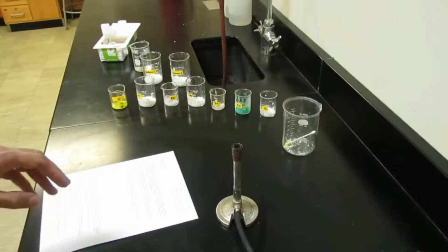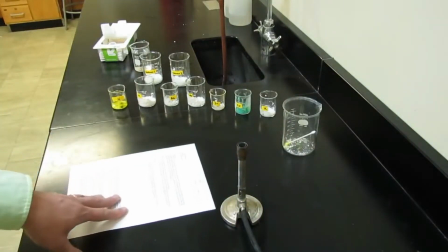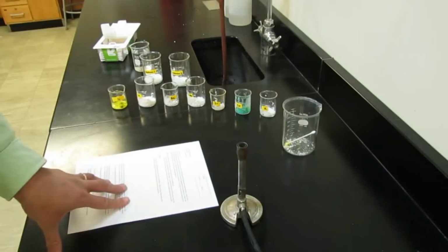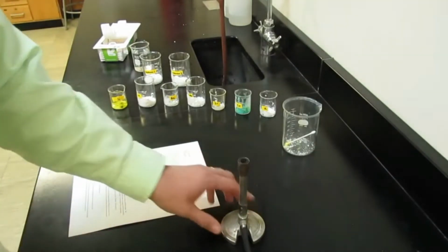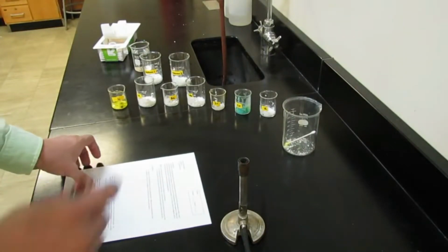Okay, welcome to our flame test lab. I'm going to show you folks how to light a Bunsen burner today, and we're also going to do our flame test experiment for you guys, in case you weren't here, or when you are here, you will get a good idea as to what exactly you need to do.